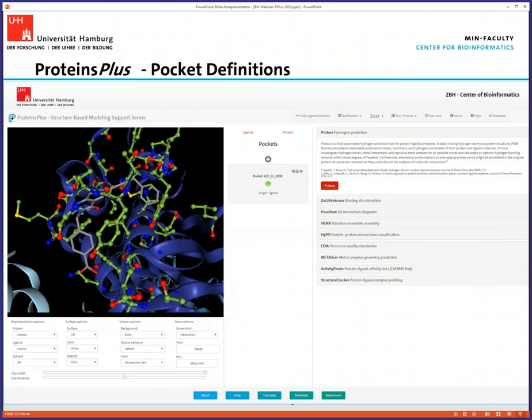Recently, we added functionality that you can actually work with your own pockets in Proteins Plus. You can design your own pockets — take small molecules and create the pockets around them, and also edit them: add amino acids or remove some if they don't fit your purpose. Then you can also start calculations with these individual pockets.